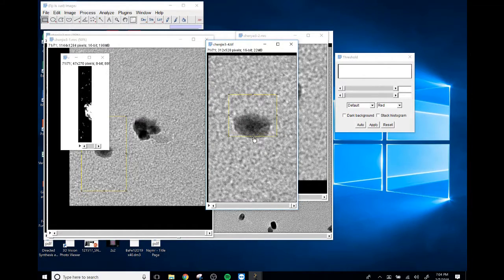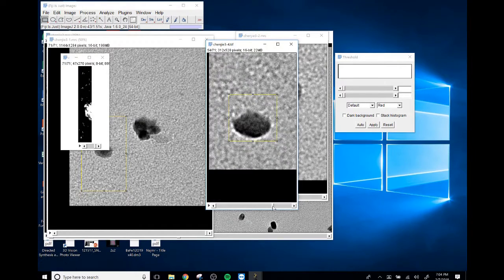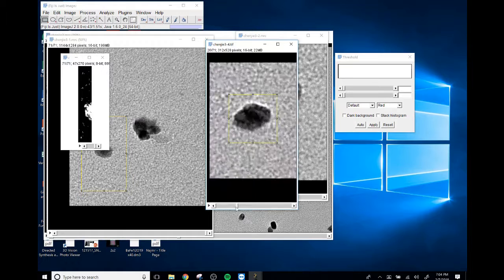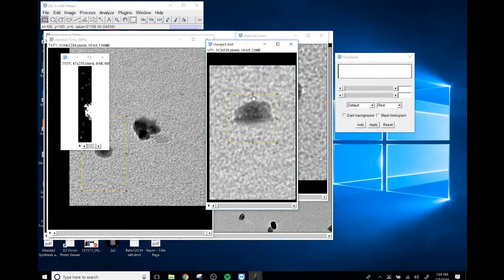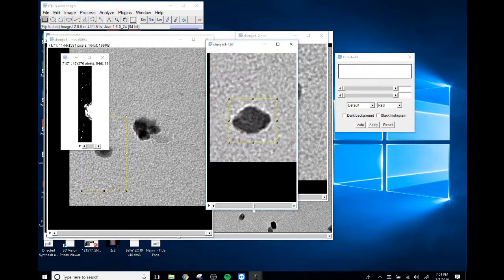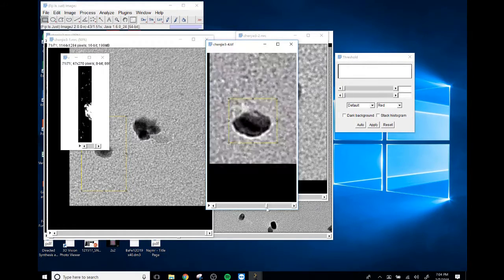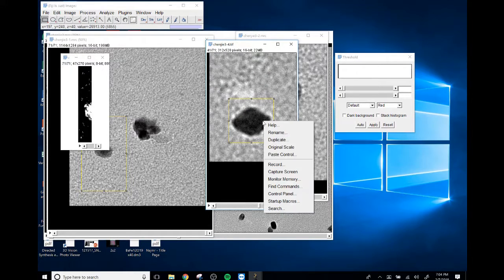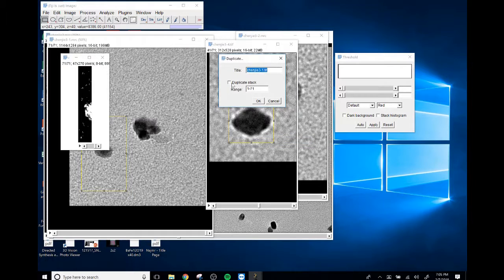Okay, so we need to go down here to catch most of the bottom of the series. And then here for the top. Left and right are fine. The right can be pulled in a little bit more. Okay, duplicate.